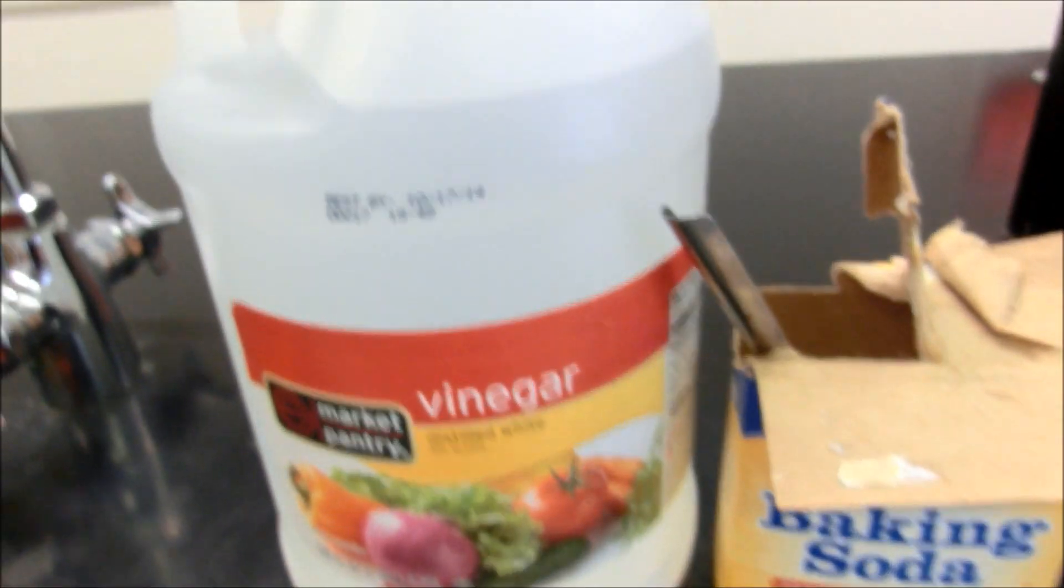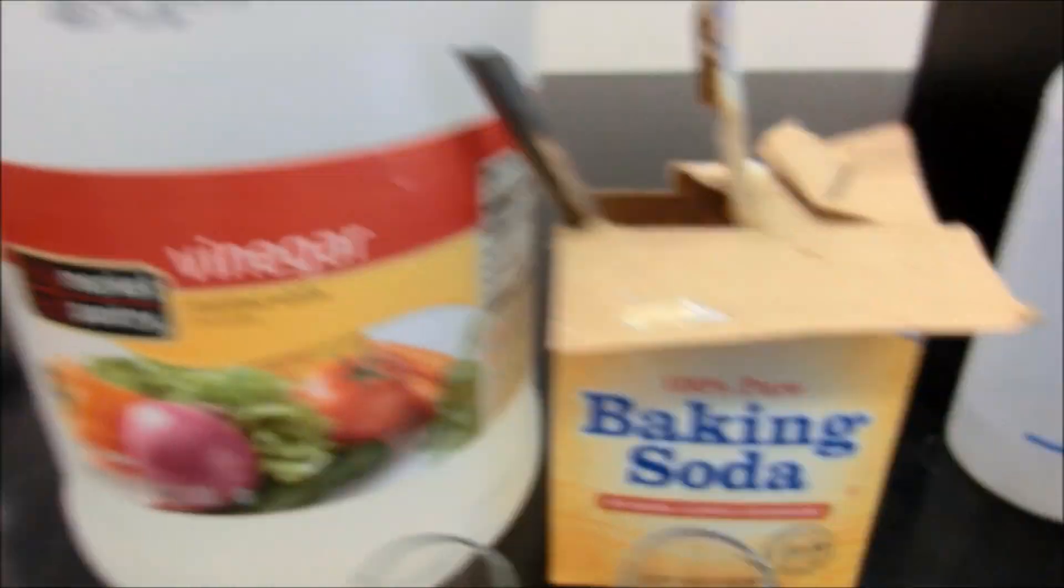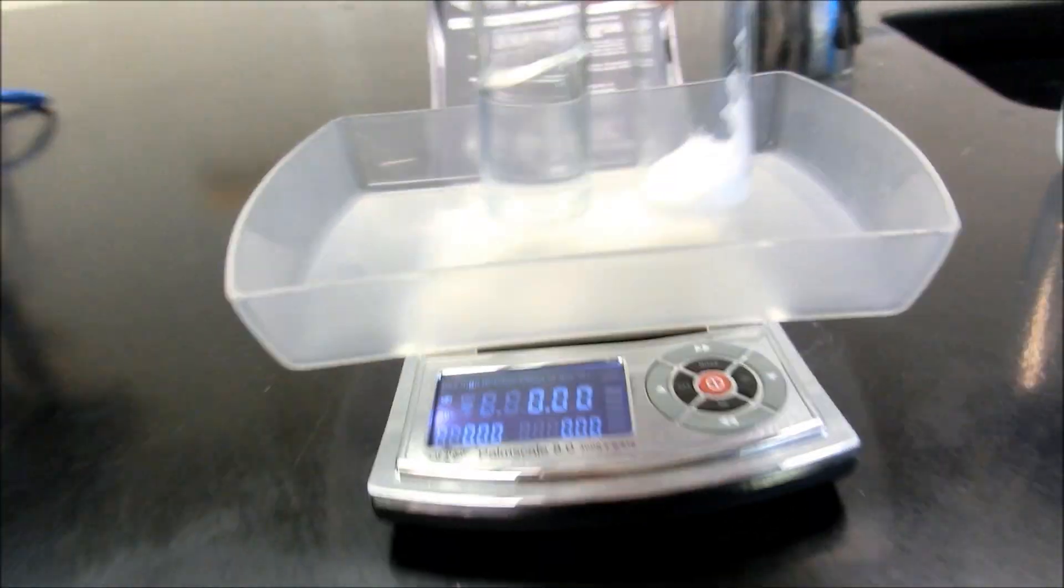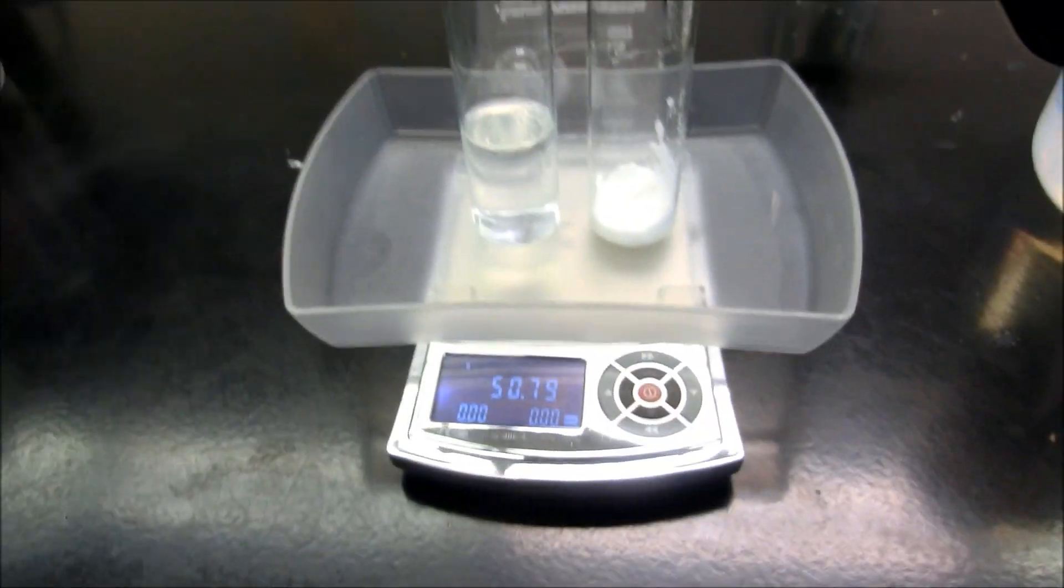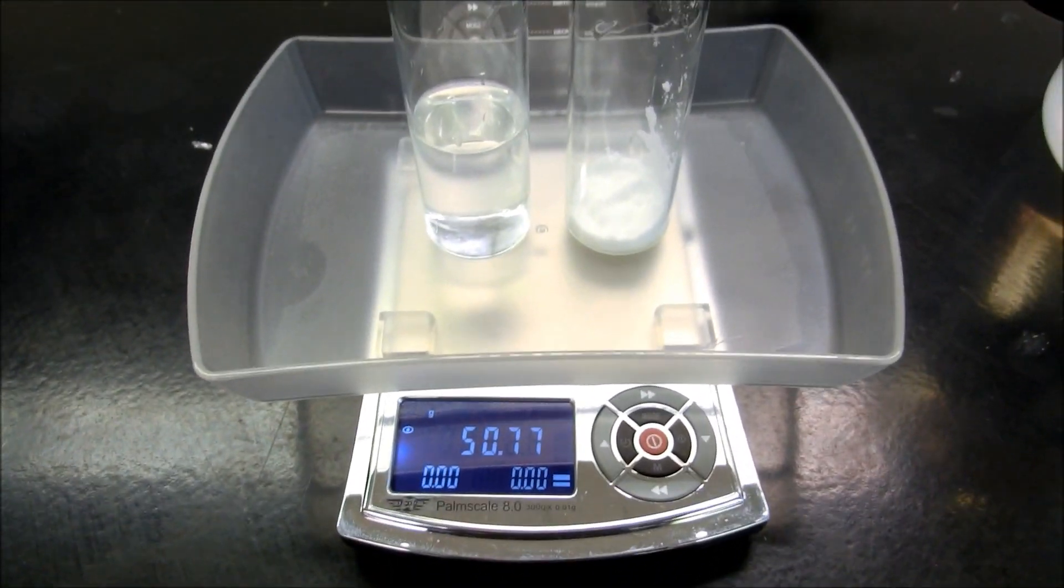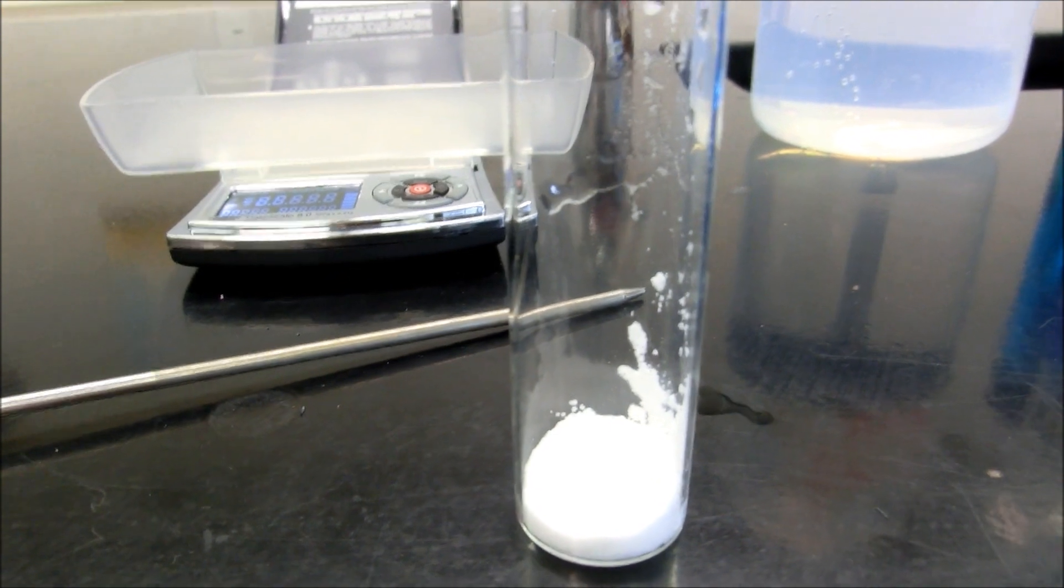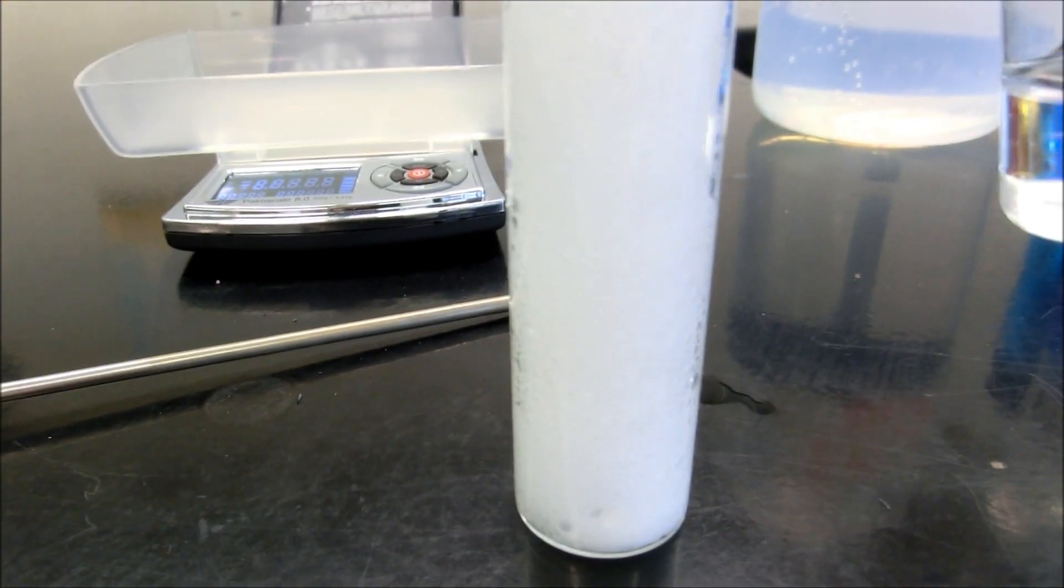Last but not least, we have vinegar, which is hydrogen acetate. We have baking soda, which is sodium bicarbonate. We put these two containers on top of the balance, and we end up having a mass of 50.77 grams. Pulling those two off. I'm going to put the vinegar into the baking soda. Oh no!